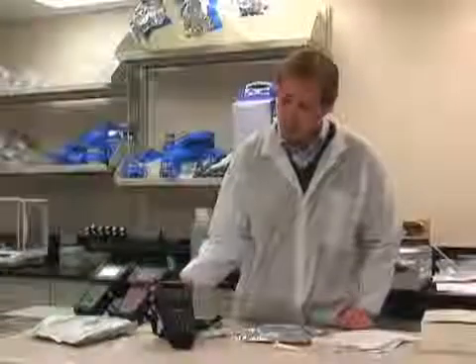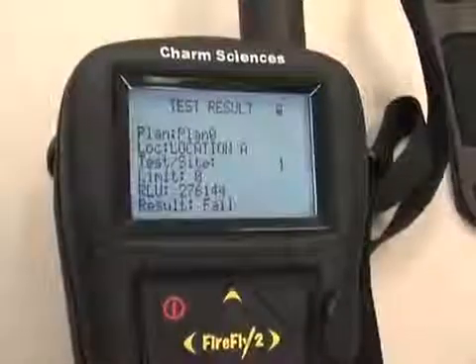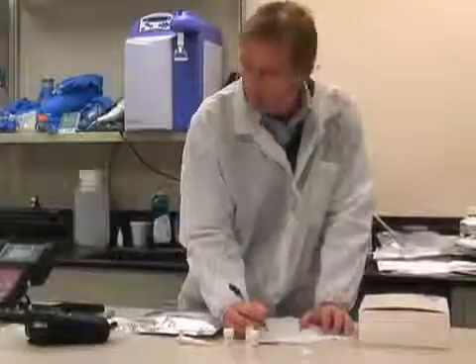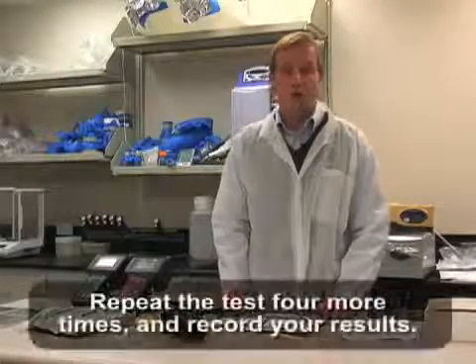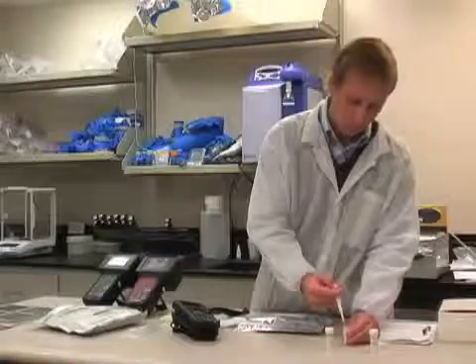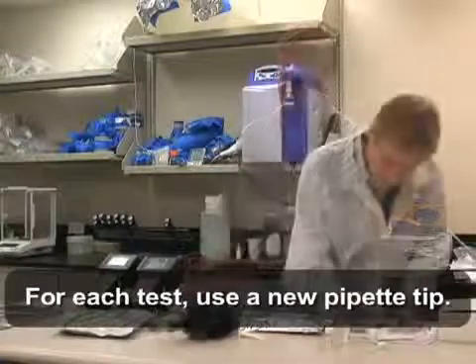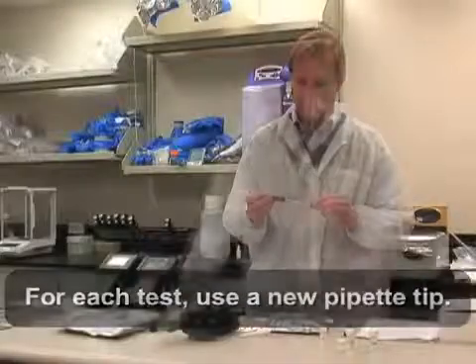The Charm system will then record the data, and in this case, we get a reading of 276,144. You then record that result on your record data sheet that comes with the side-by-side evaluation kit, and then you record the result, which in this case is a fail. We then do 4 more replicates of that exact same test and record the results. It's important to change the pipette tip each time you do a test in order to get an accurate reading.